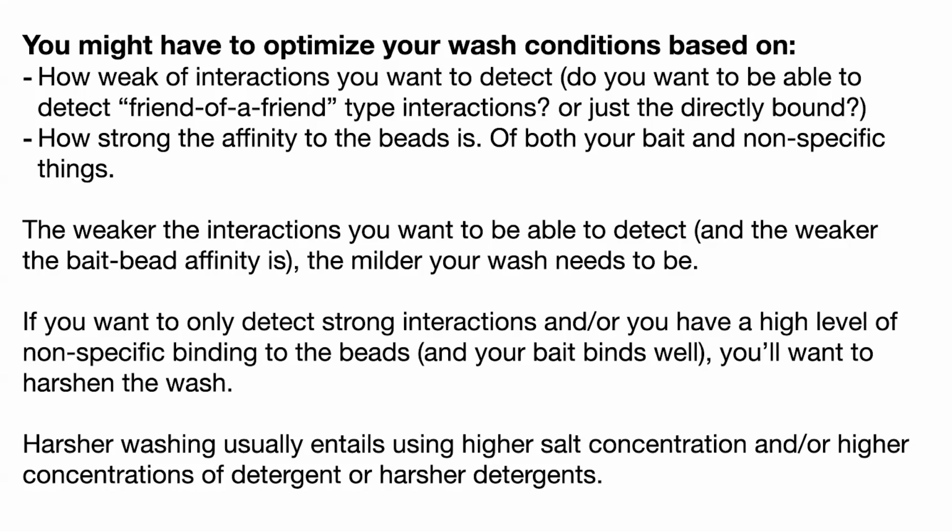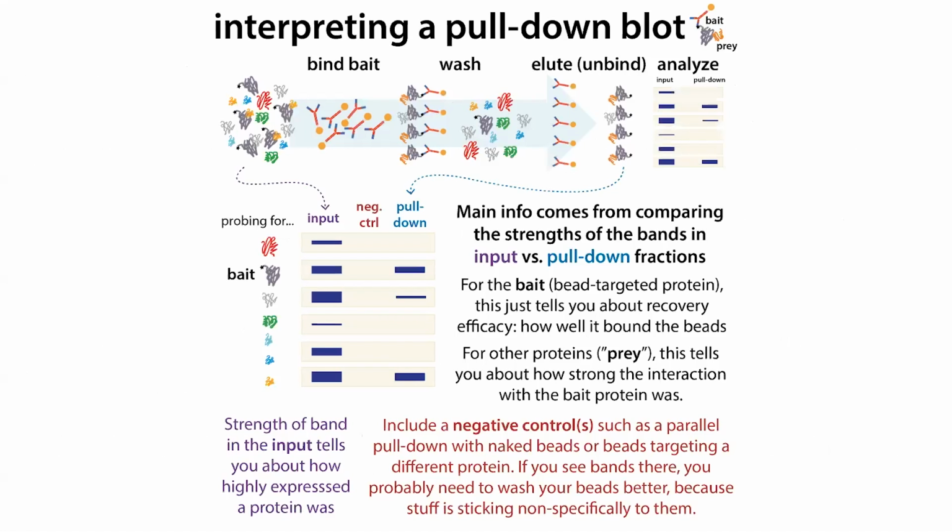In this way, we can pre-clear things out. We can get things to bind this decoy bait, remove those non-specific binders, and then we add in our actual beads.